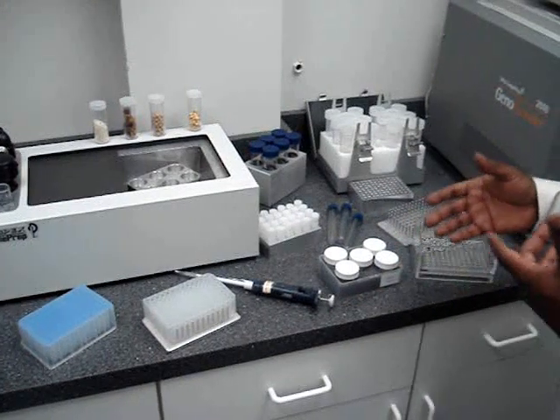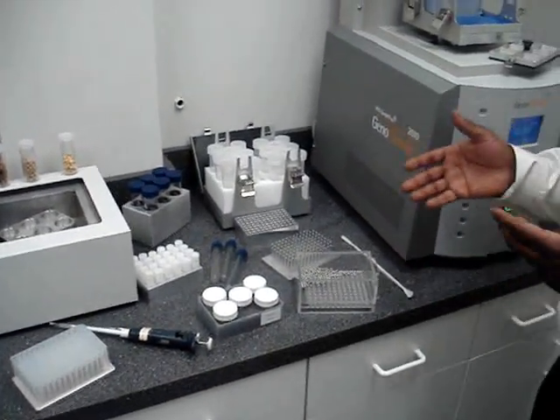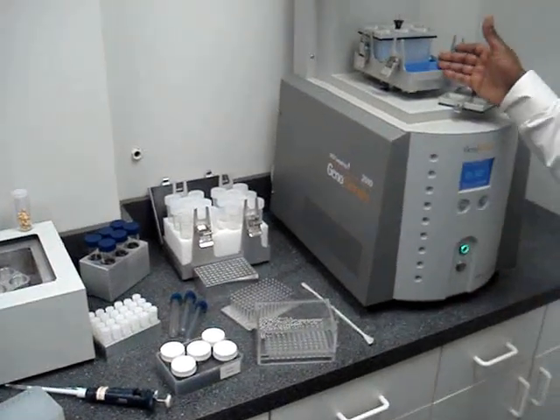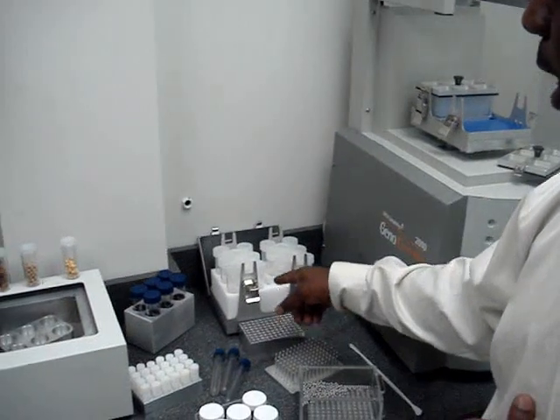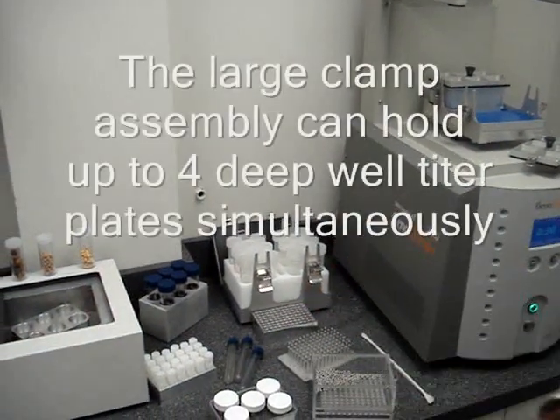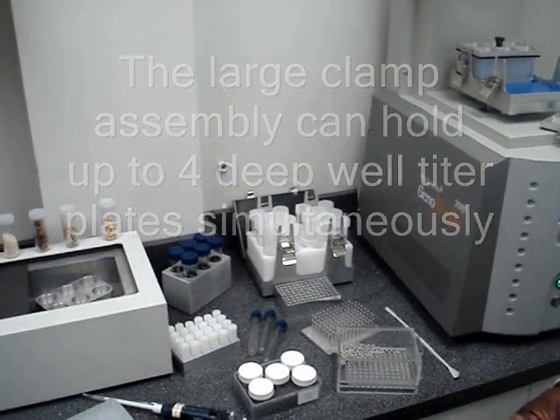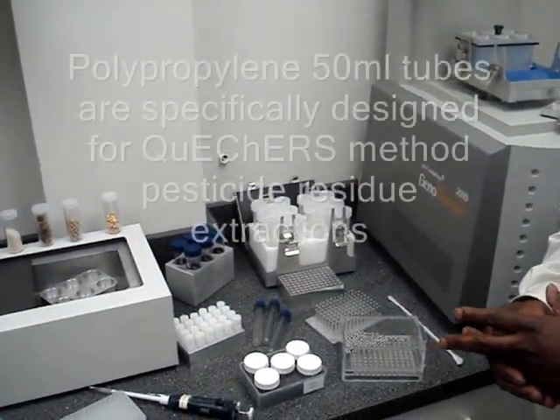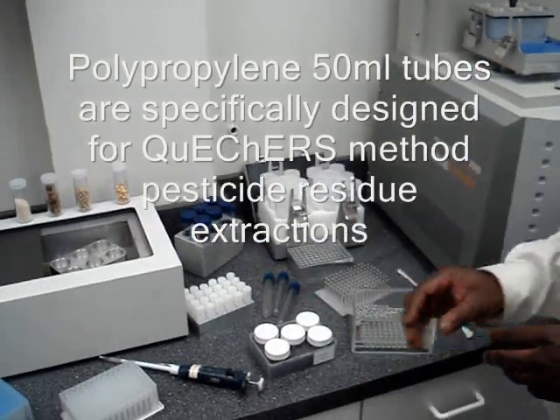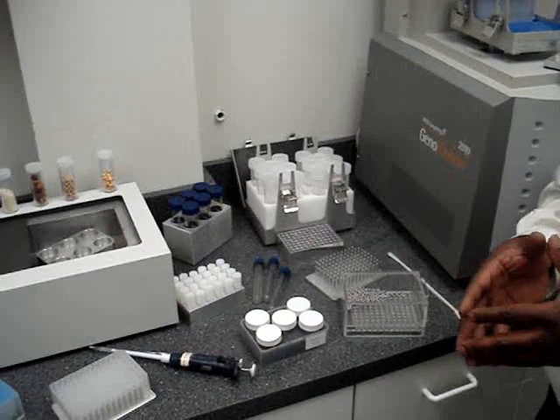The Geno Grinder can also be used for cryogenic grinding, as well as grinding samples up to 50 mLs. We also have a large clamp assembly which allows you to do 4 titer plates at one time, 16 50 mLs at one time, 30 15 mLs at one time — an array of different formats and sampling within one to two minutes.